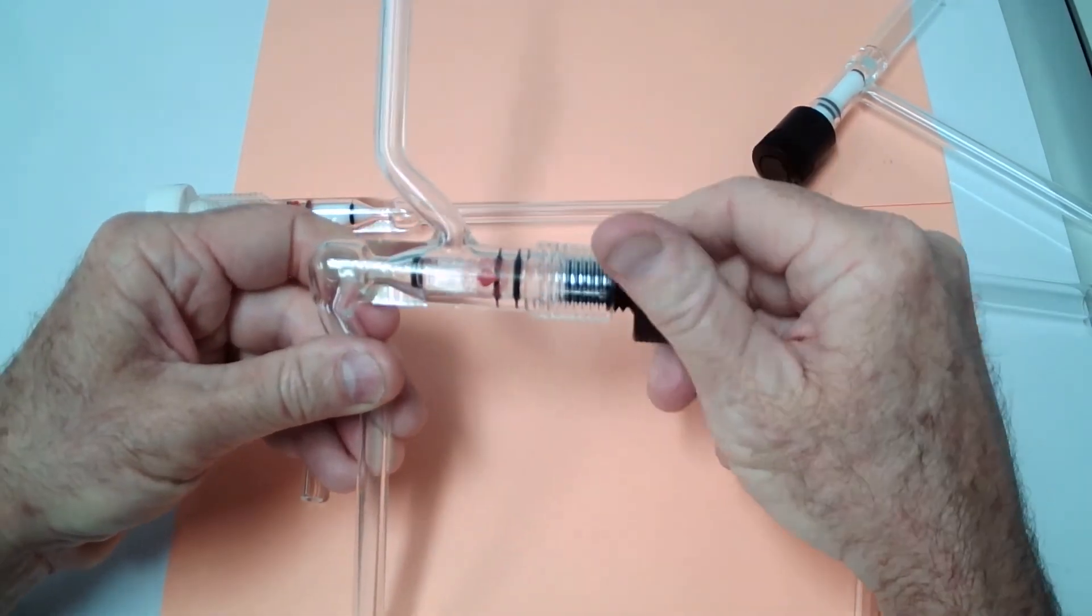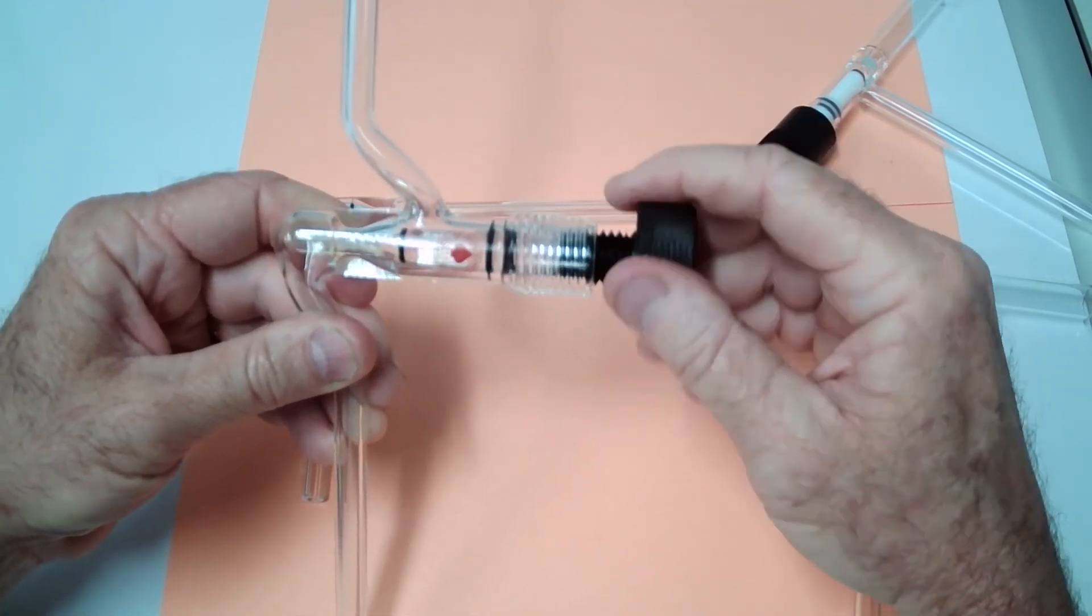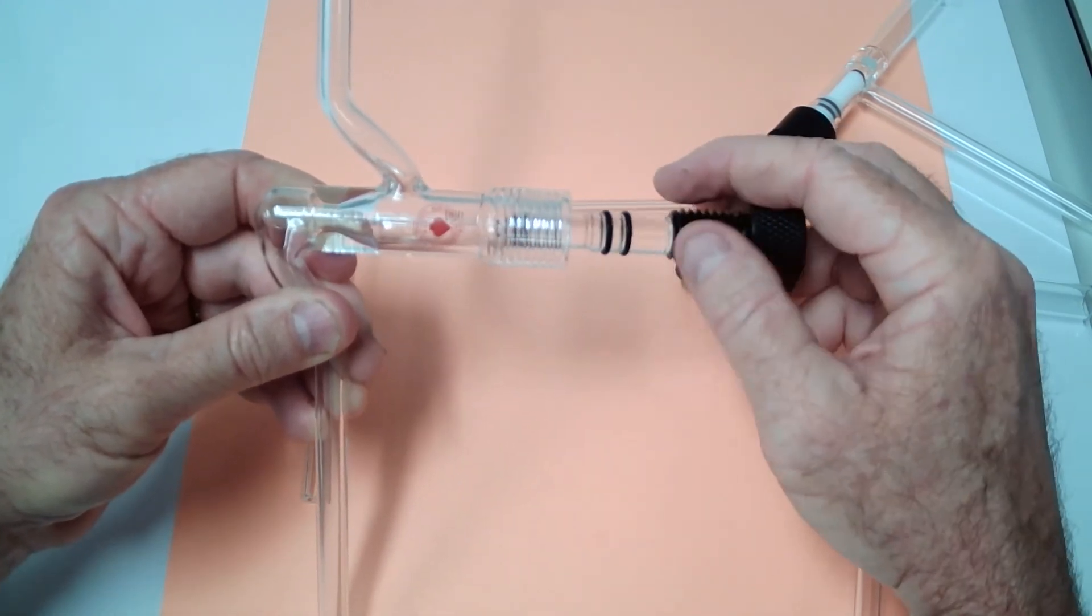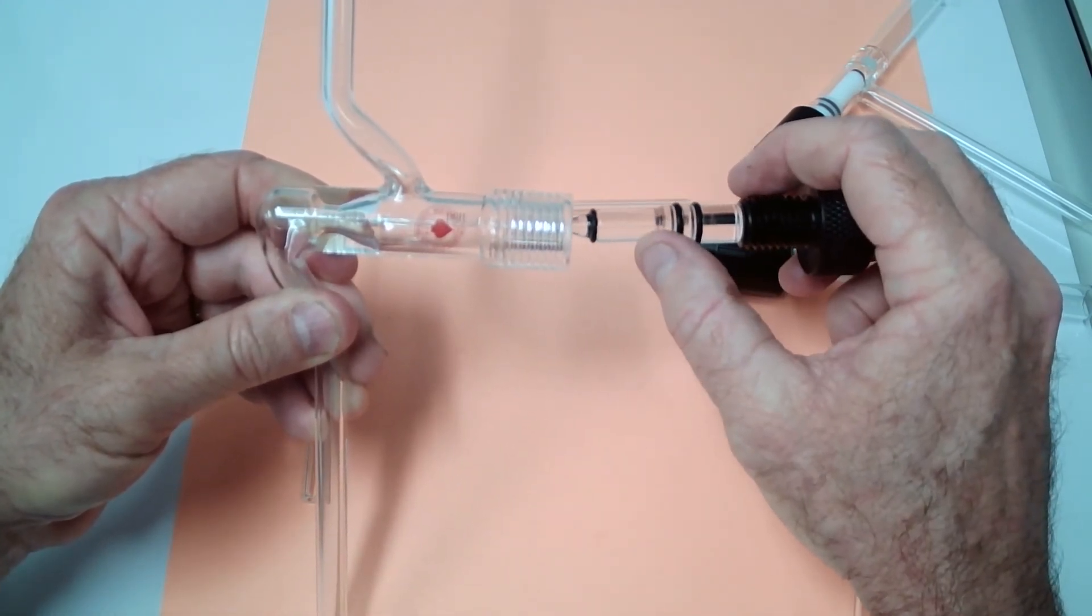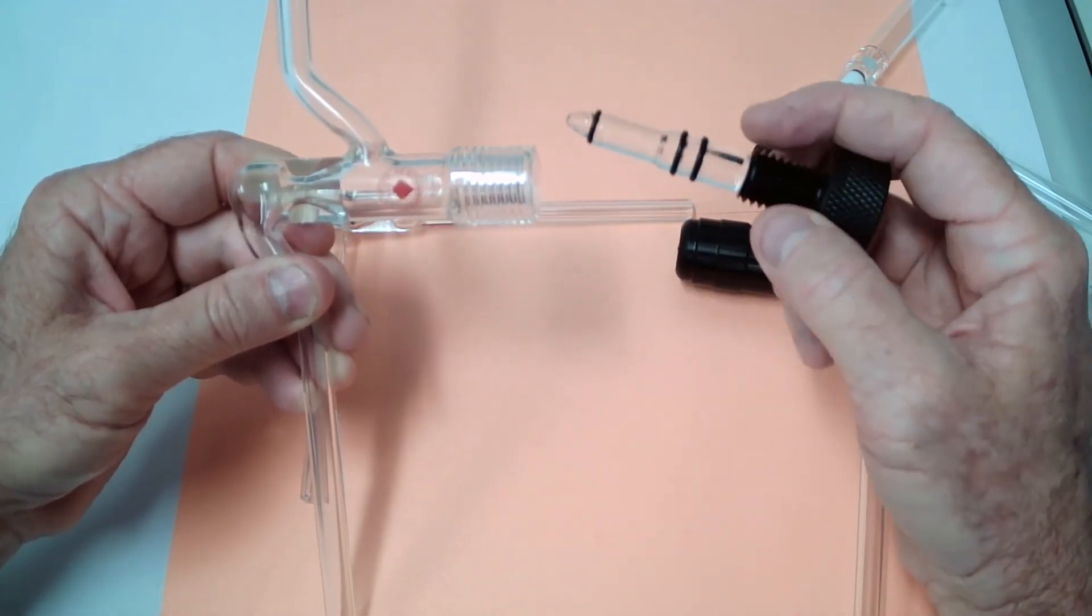Here is another style from this company that has, again, internal threads, but the plug material is not made of Teflon. It is actually made of glass to prevent any outgassing of Teflon or anything.